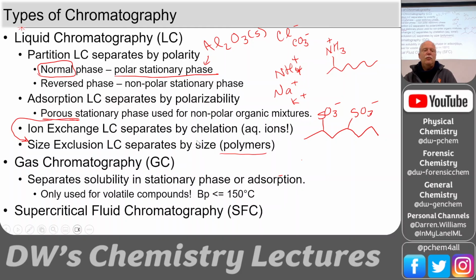And then we could also change the mobile phase too. We could change it to make it a gas. We could also make it a supercritical fluid. So this is a fluid above its critical point.